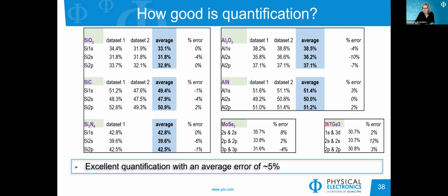And here's an example of a silicon germanium bimetallic compound. Also, we can combine different transitions from both silicon and germanium to extract quite good quantification results. So it's really important feedback that we are getting from compounds where we know what the stoichiometry is.